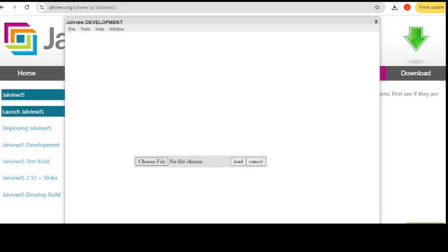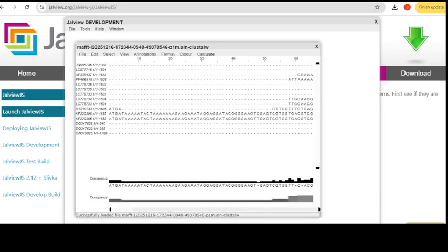That should be your file, starting with MAFFT. You just click on that and say open, and it's right there. The file is there, and then you have to say load. Okay, so let's see how long it would take. It's not a huge file, so it shouldn't take very long, because there you go.